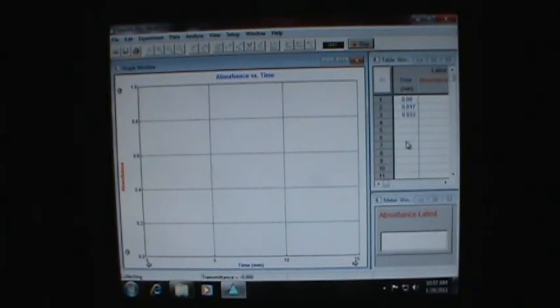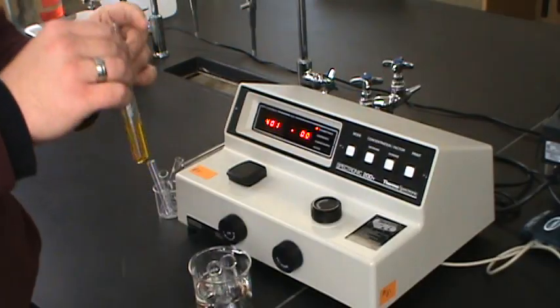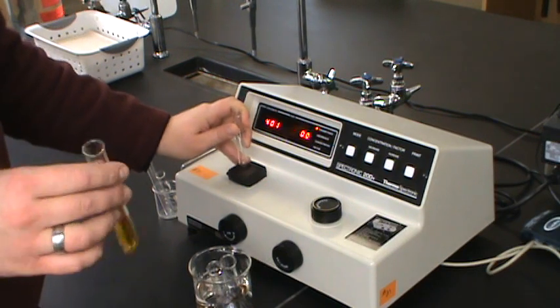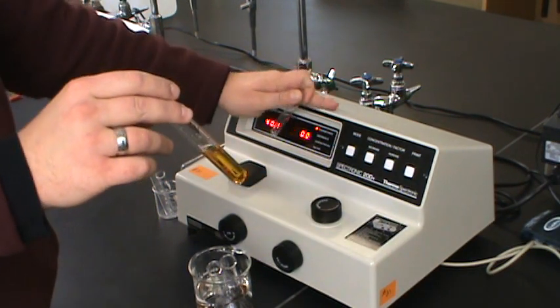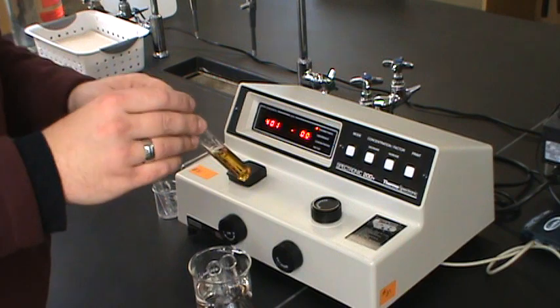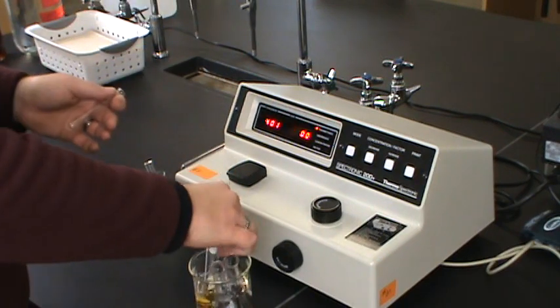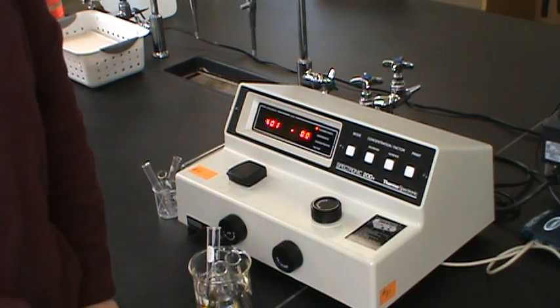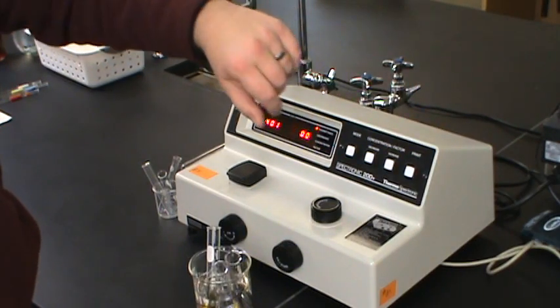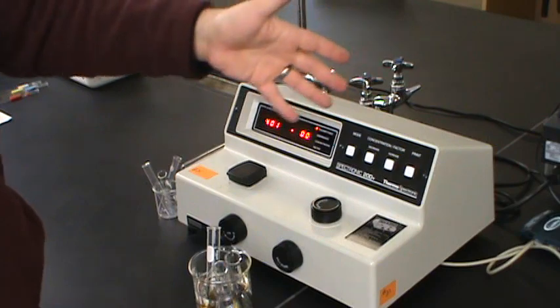I just clicked collect and you see it's starting to collect time, but it's not doing anything with absorbance because I don't have anything in the instrument. And that's okay because at this point, all we really need is for the computer to keep track of time. Now we could immediately pour this into a test tube and put it in the instrument, but there's really no need to. From the spec 20's perspective, this is an extremely dark solution. So we can just let it sit and react for a little while in the room temperature water bath until it's almost ready to finish reacting.